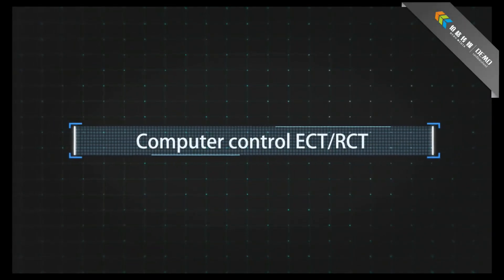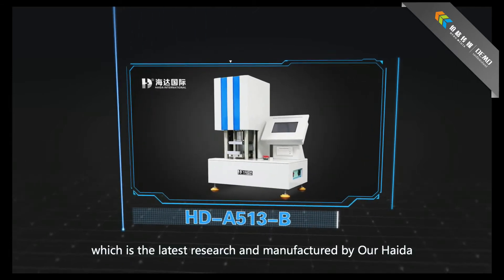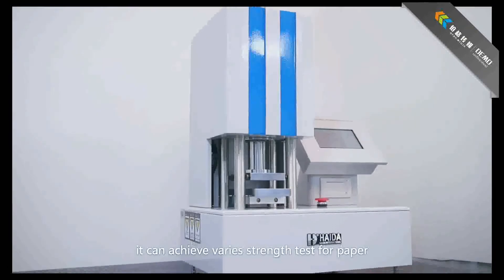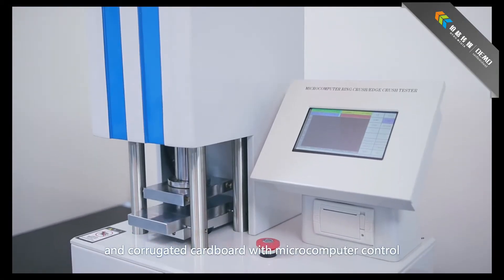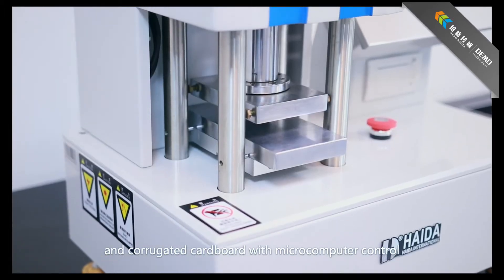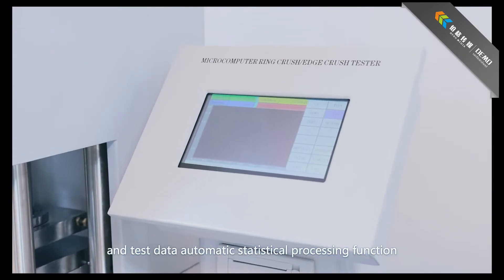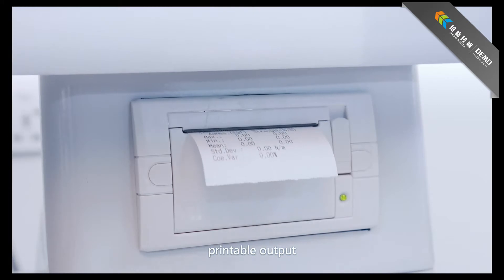The computer-controlled ECT/RCT machine is a high-accuracy, multi-function machine, the latest research and manufactured by Haida. It can achieve various strength tests for paper and corrugated cardboard with microcomputer control, touchscreen display, automatic test, test curve synchronization, test data automatic statistical processing, and printable output.